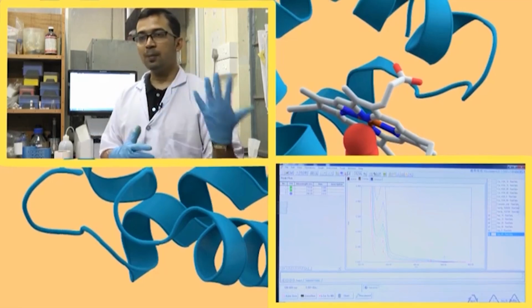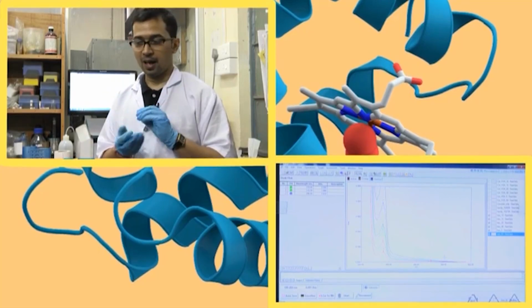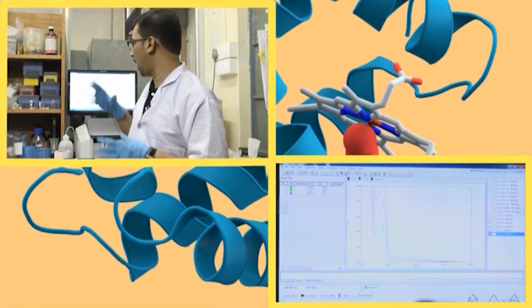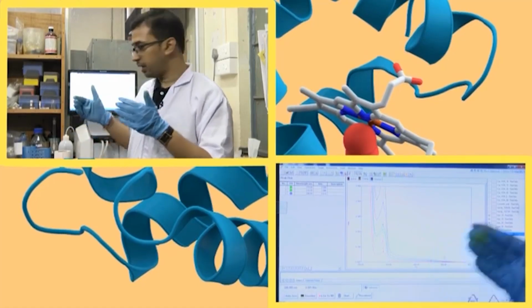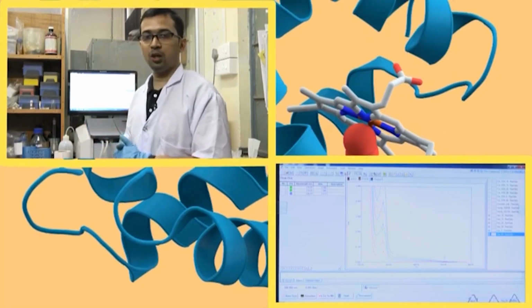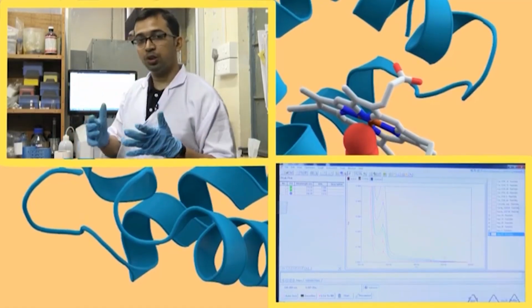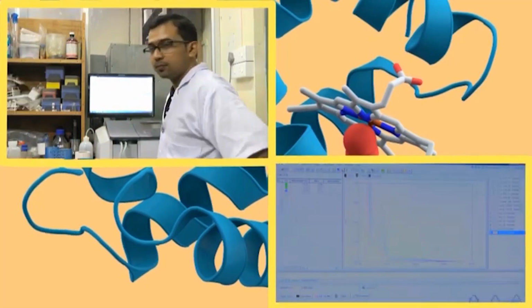Now, suppose we are measuring the absorbance. At which wavelength are we interested? As I said, it is 1 by delta A, but at which wavelength? The wavelength we are considering is where the maximum change in curcumin takes place, which we can find once we get the subtracted values. Now we will proceed for subtraction, that is, we will subtract the blank, the concentration of HSA, from its respective curcumin plus HSA complex.